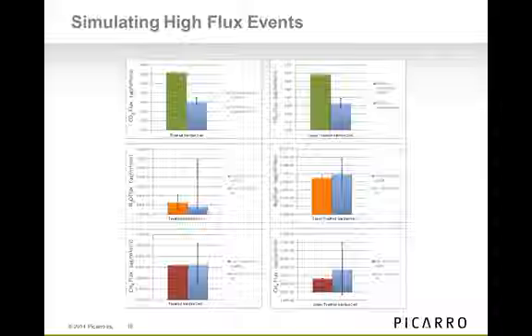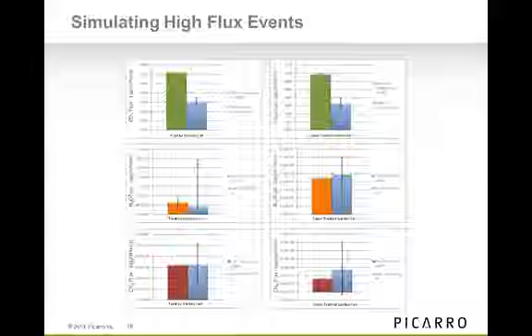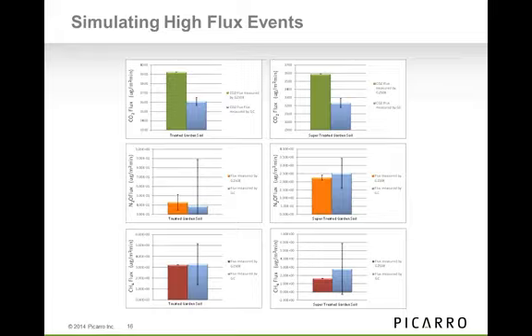And CO2, there's actually a slight discrepancy in the two measurements. It's about a 9% error, and I'm currently trying to figure out what happened there and if perhaps my calibration was off for CO2 and the linearity. It goes out of linearity at some point, but I'm currently working on that as a new project.